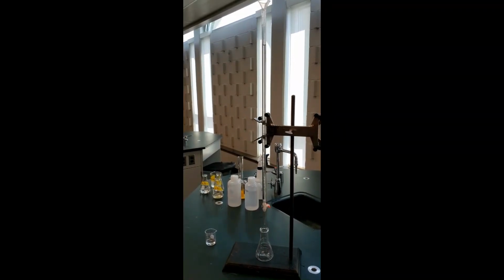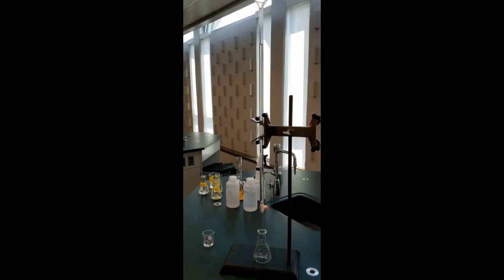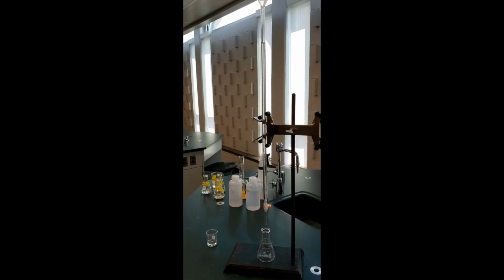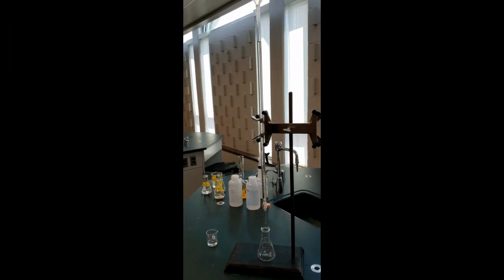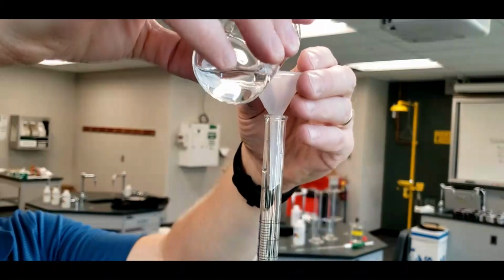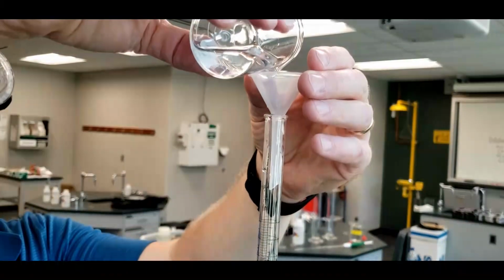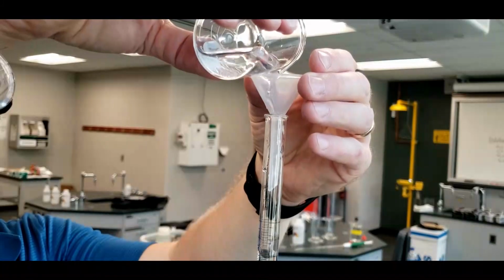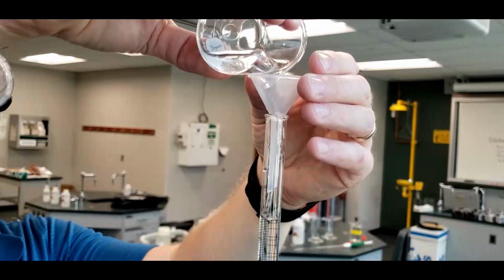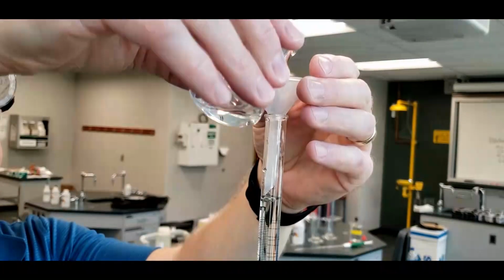You always want to use a small piece of glassware to fill the burette. You don't want to use that big bottle. That's too dangerous. All right, let's look at some things here. To fill this, hold this funnel, pour in the solution, and you want to fill it right to the 0, but if you go past it like this, it's okay.